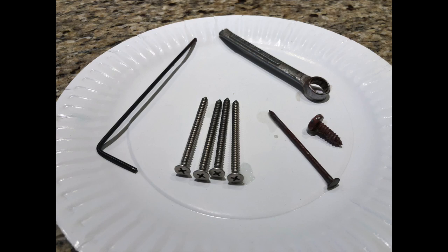Here is a picture of the metal objects after their bath in the vinegar solution. You might not be able to tell, but the two screws in the very middle soaked for about an hour and 15 minutes, whereas the other metal objects only needed 10 minutes. As well, I put a couple of the screws that I didn't use on the ends for comparison, which makes it plain to see that there was hardly any copper plating on the ones that did soak.